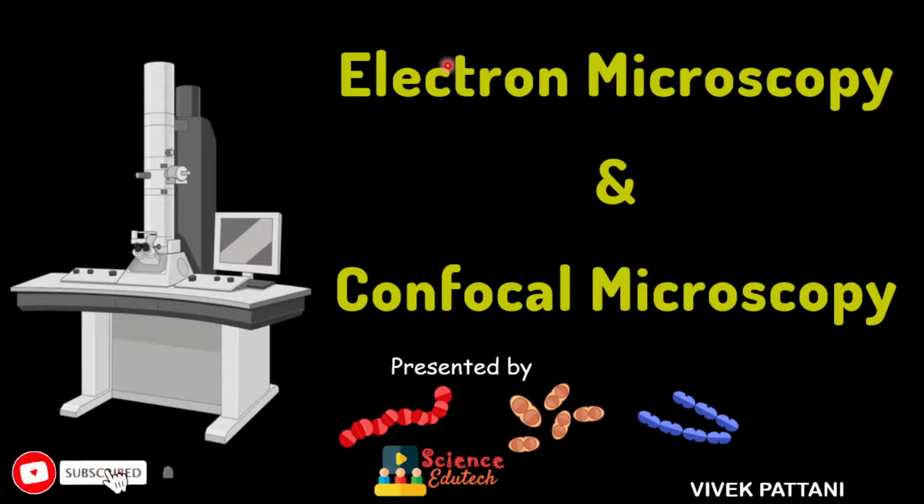The prerequisite if you want to study electron microscopy is that you first need to study the basics of microscopy, that is resolution, magnification, as well as the refractive index. So study those terms first, and other types of microscopy, and then go for the study of electron microscopy.